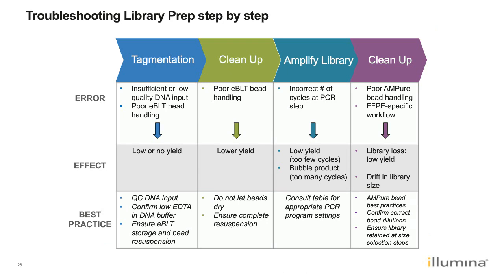Overall in library preparation, we want to ensure expected and sufficient library yield to proceed to the enrichment step. If a drop in library yield is observed, it can derive from any of the steps discussed. Best practices include proper handling of EBLT beads — storing them upright and preventing drying at any step — and using the recommended number of amplification cycles. For FFPE samples, follow the specific cleanup protocol in the post-amplification cleanup step. This slide can be used as a troubleshooting reference.